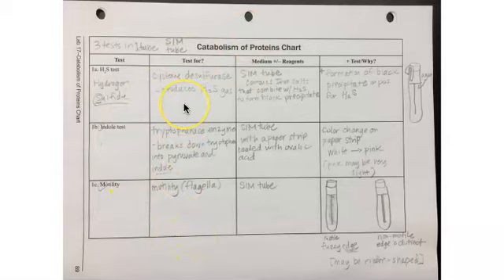So again, for the hydrogen sulfide test, we're looking for the enzyme cysteine desulfurase. The product of cysteine desulfurase includes hydrogen sulfide gas. The growth medium is the SIM tube, and it's going to be the SIM tube for all three of these tests. The SIM tube contains iron salts that combine with hydrogen sulfide to form a black precipitate. So the positive phenotype for this test is a color change to black because of the production of hydrogen sulfide.